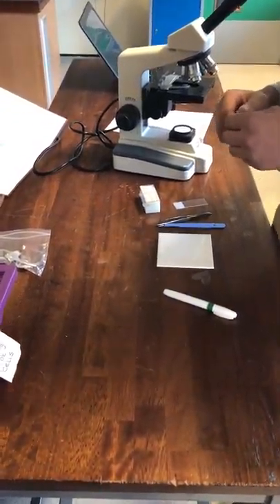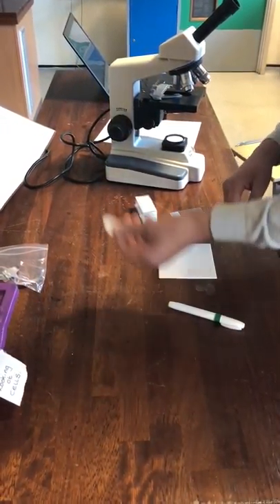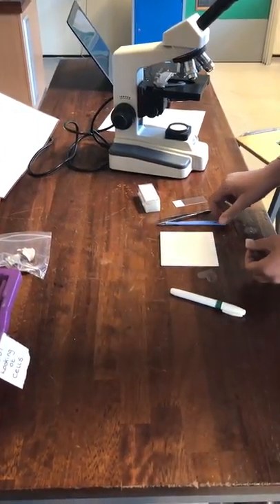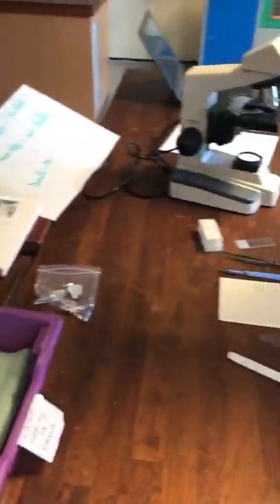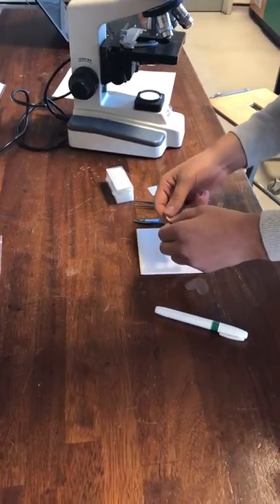Hi, so we're looking at the core practical on using microscopes today. We're going to be looking at using onion cells. To start off with, we've got a scalpel and we've got forceps, and later on we're going to be using a toothpick as well. Of course, the onion — the easiest way I find to do this is to split the onion apart.